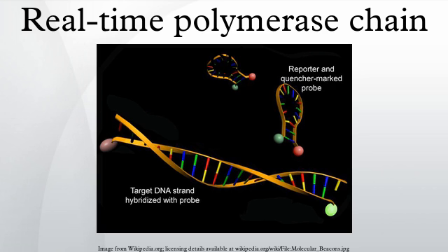Detection of phytopathogens. The agricultural industry is constantly striving to produce plant propagules or seedlings that are free of pathogens in order to prevent economic losses and safeguard health. Systems have been developed that allow detection of small amounts of the DNA of Phytophthora, an oomycete that kills oaks and other species, mixed in with the DNA of the host plant.